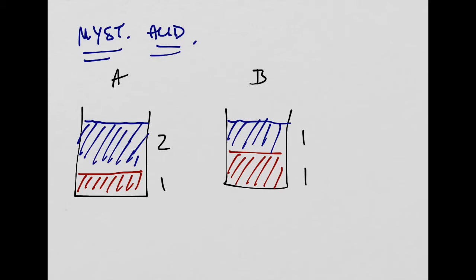If you take a look at your lab handout, you'll see the number of drops that you used in each one of the samples that you ran. I think it had 48 drops altogether, but those 48 drops were divvied up. I don't actually remember the numbers, but understand that they were divided up in a 2-to-1 ratio, 3-to-1 ratio, 1-to-1 ratio, 1-to-2 ratio, 1-to-3 ratio.